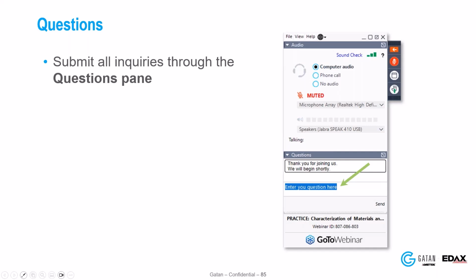Usually for these type of problems, I look and say, what does it look like after each step? And then add the next step on to see, okay, am I happy or not? Is it telling me what I need to know, or do I need more tools? From that, you could certainly turn on NLPar plus spherical indexing and say, hey, I'm just going to walk away and come back and not use each intermediate step as an option.